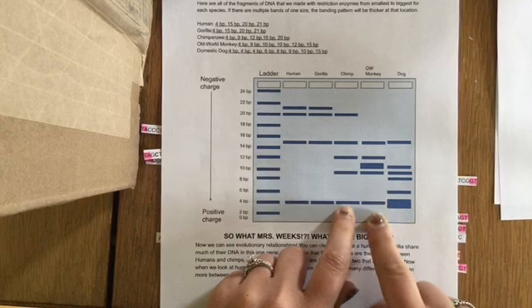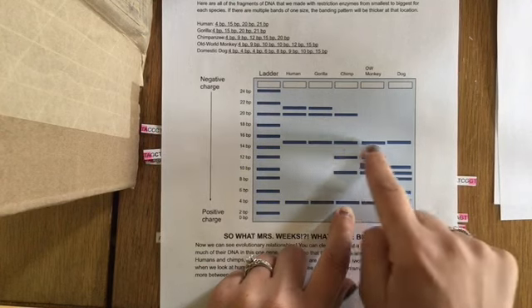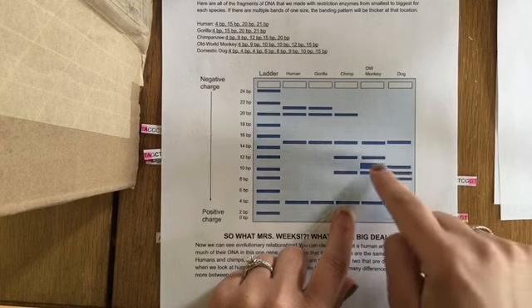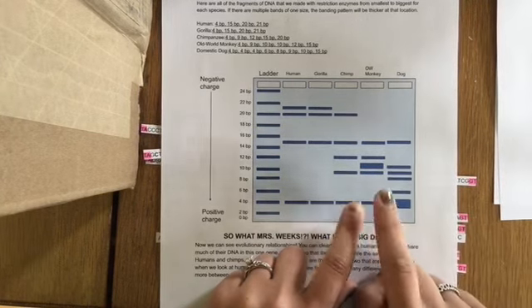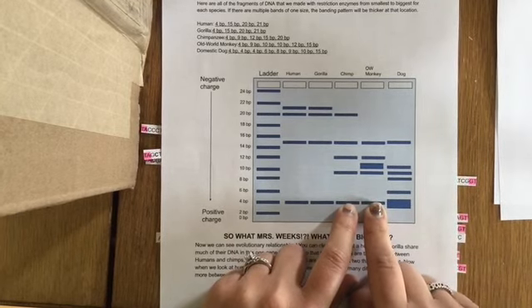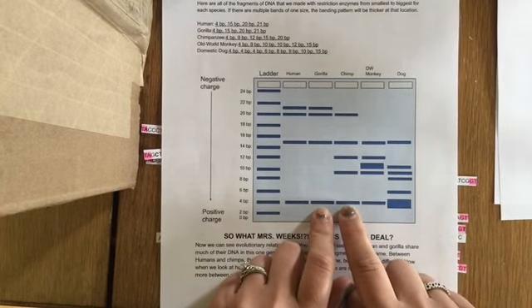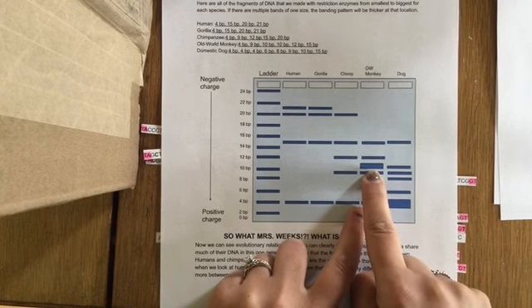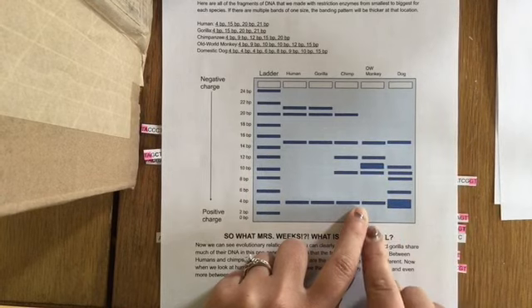If we look at the chimp versus the old world monkey, we have 1, 2, 3, 4 bands that match and 2 that don't. So a chimp and a monkey might even be more closely related to each other than the chimp and the gorilla. And if you notice here with the monkey, we have 1 band that's thick, so that means that there's multiple sections of DNA that actually have that same amount of base pairs.